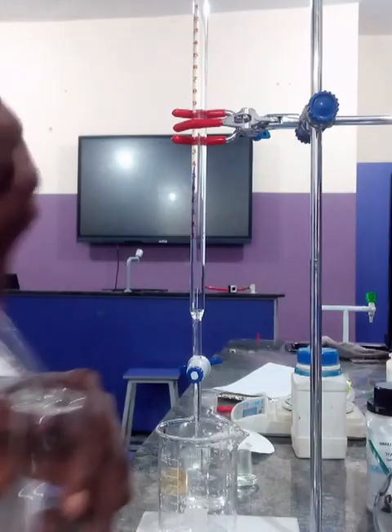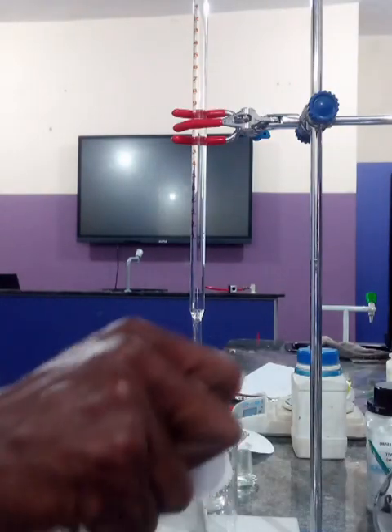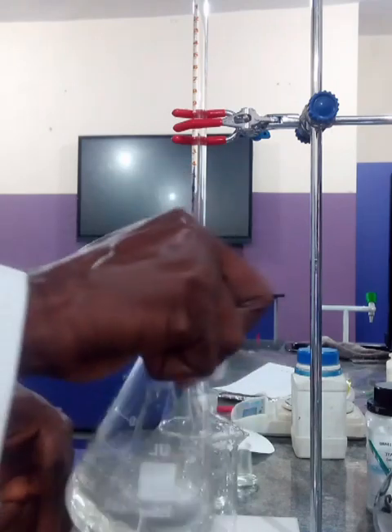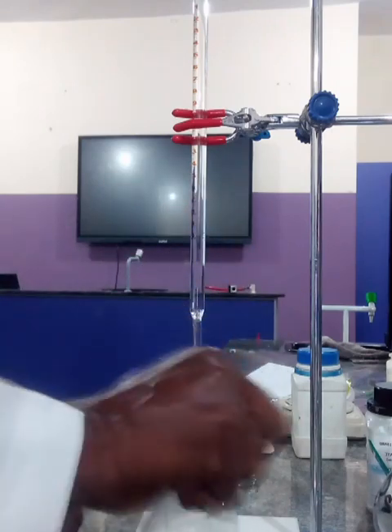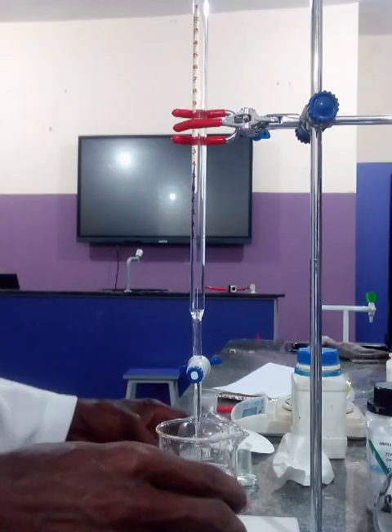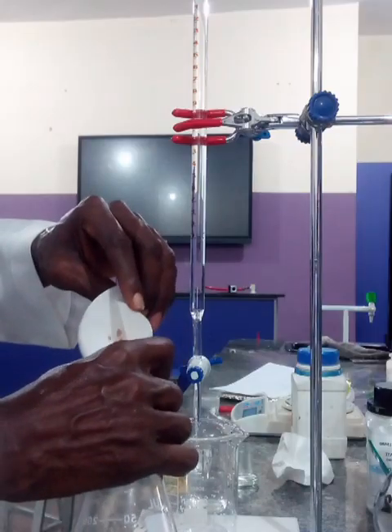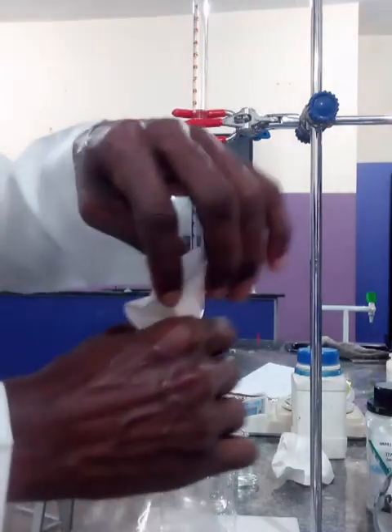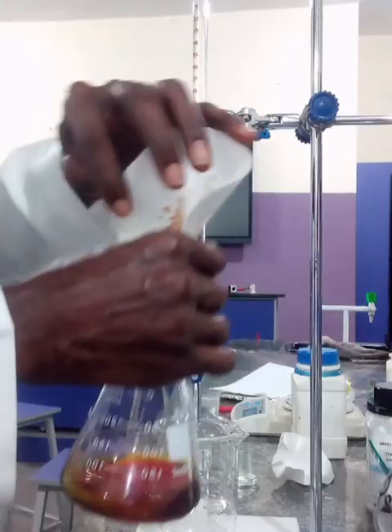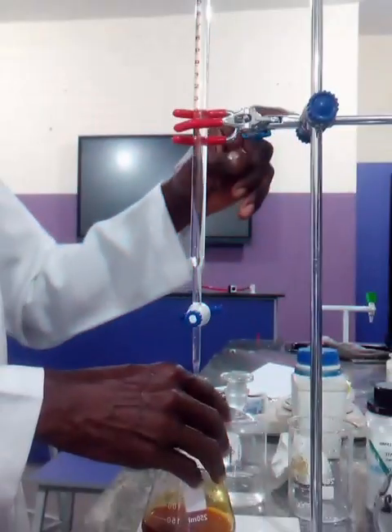So you carry out this titration against the iodine solution in the conical flask. That means your burette should contain the standard sodium thiosulfate solution. Fill your burette with the sodium thiosulfate solution and then titrate it with the iodine solution in the conical flask. Then you get an endpoint.